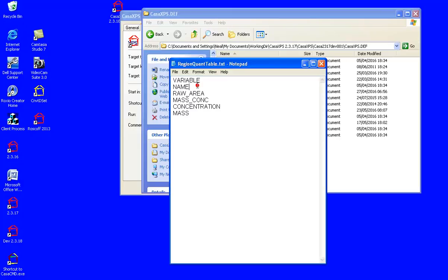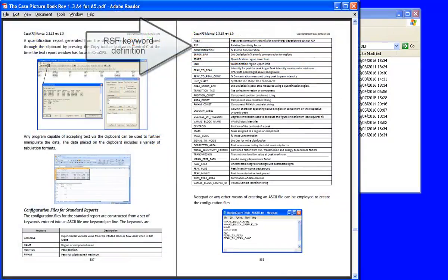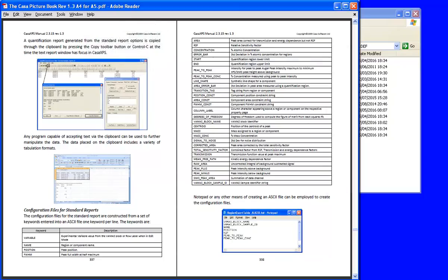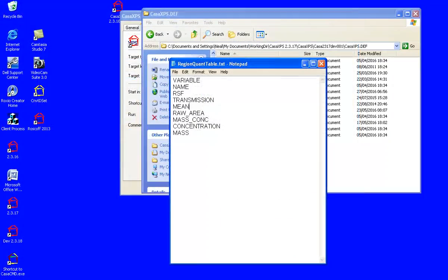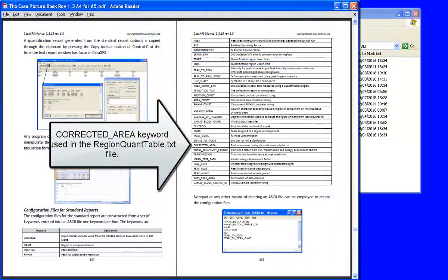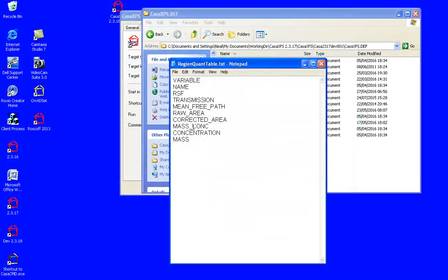I could say RSF transmission mean free path and I'm going to obtain the raw area, the corrected area and the mass concentration.